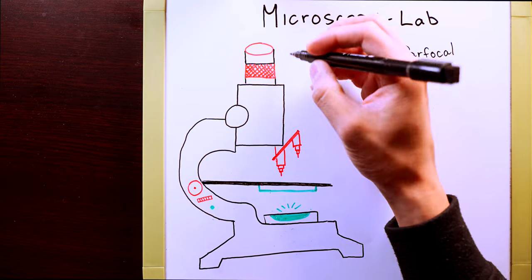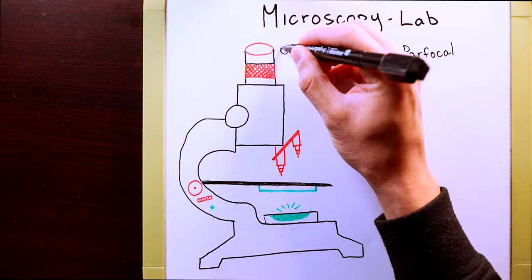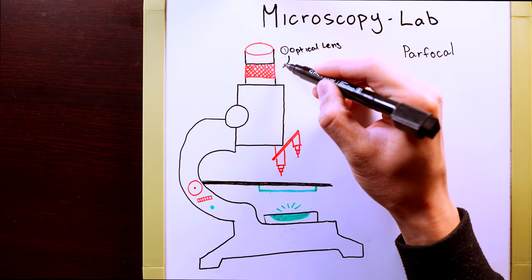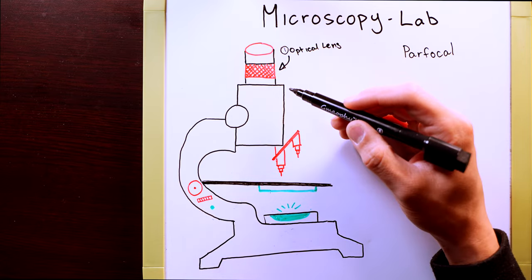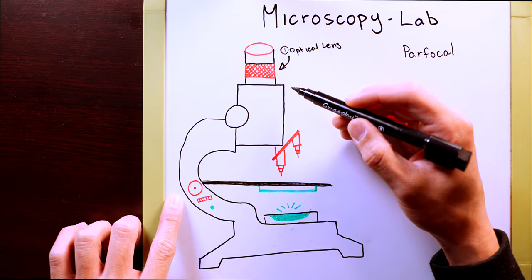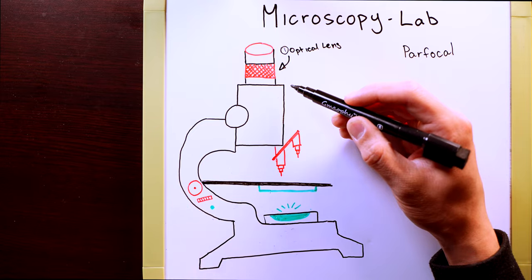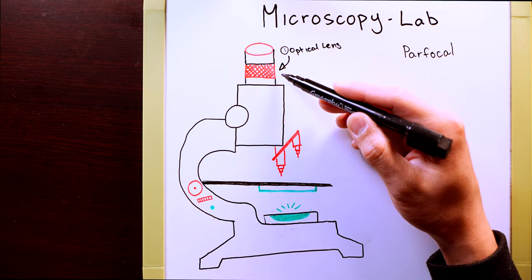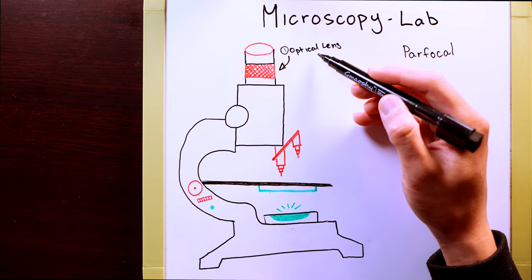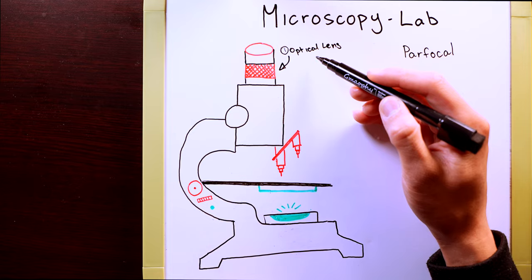Starting from the top we have our optical lens. And just below that we have our adjustment for the optical lens. If for some reason your coarse and fine adjustment cannot fine-tune the picture of your slide, you might want to adjust this. And also know that this adjustment here for the optical lens is not on every single microscope.